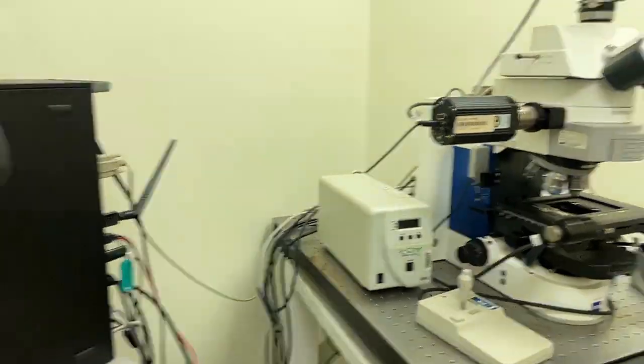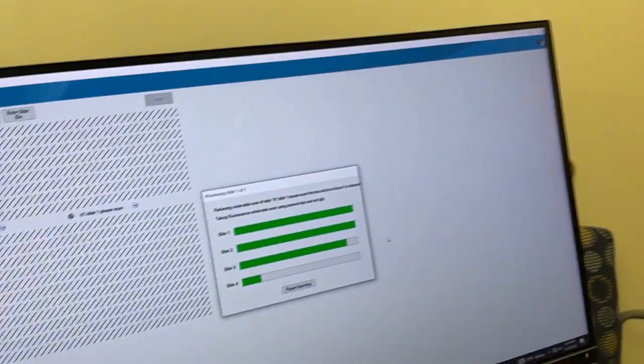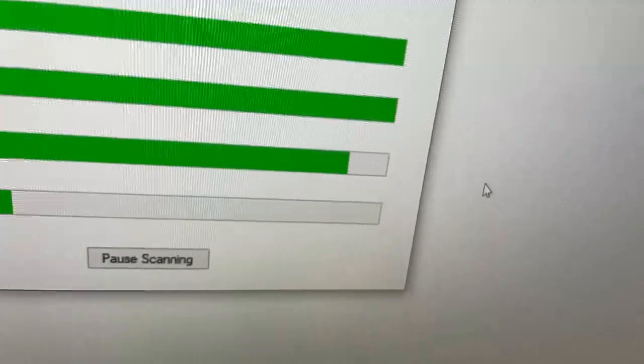Is it an auto gain for each capture? No, you define the exposure and it's the same exposure for all fields. And the autofocus is not very good a lot of the time. Actually, for that microscope, there is no autofocus. You just manually define the focus for a few points and it kind of figures it out. See how this one works. It's almost done.